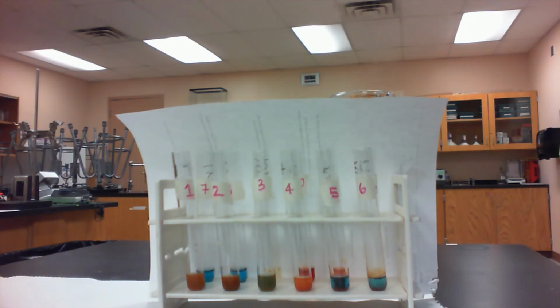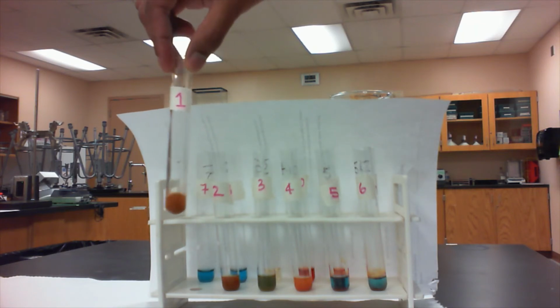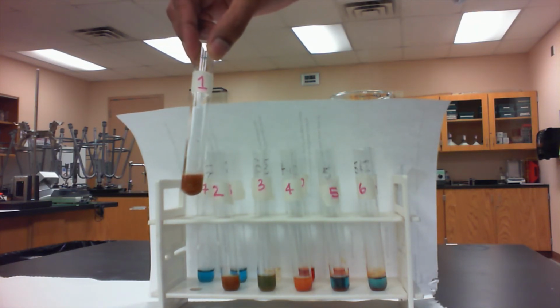And now we're going to take a look at what colors all 12 of these tubes actually turned into, right? And I would encourage you, as we go through all 12 of them, that you have your experiment handy so you can sort of match up the color changes to what they actually mean. All right, so this is test tube 1. Test tube 1 contained glucose in the Benedicts reagent.